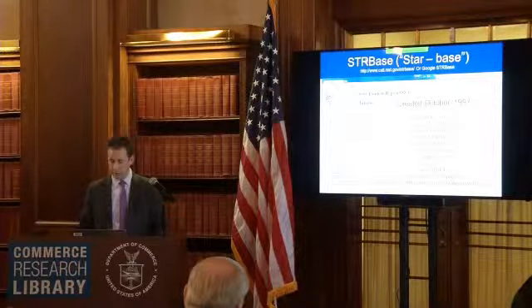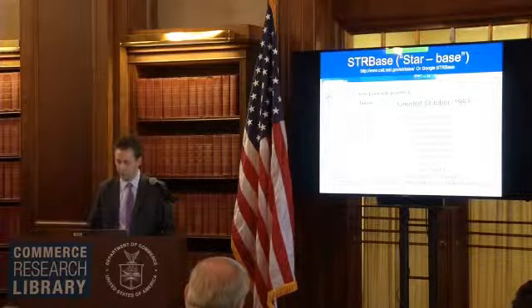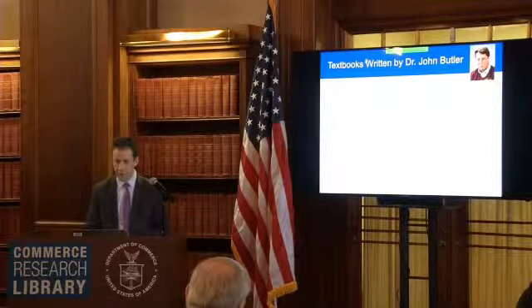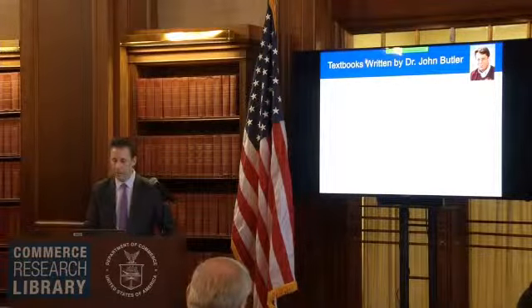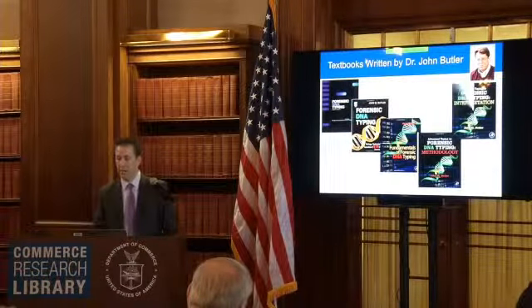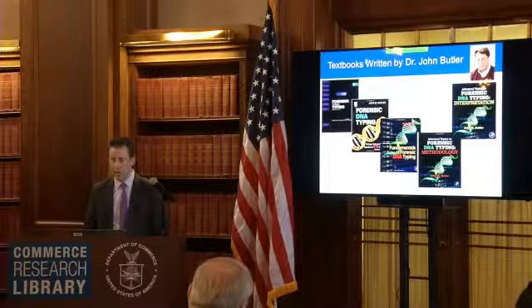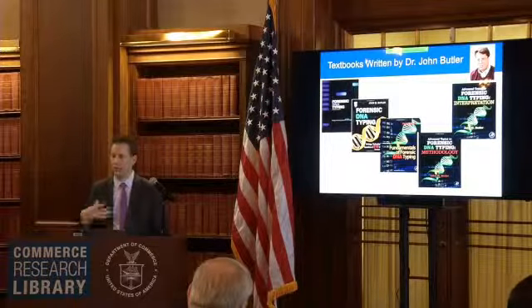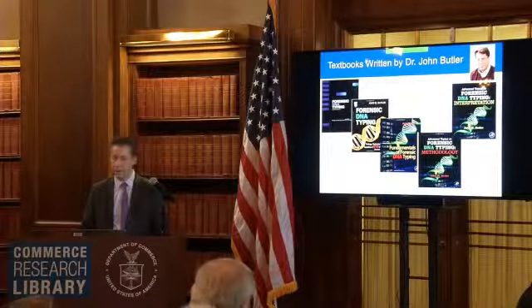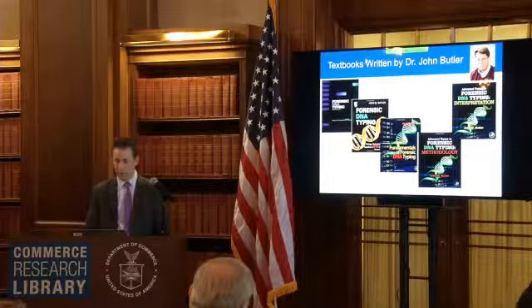We put it up here for free for the forensic DNA typing community. And you can also pull down any papers or workshops or presentations or talks that have been given since about 1998, 2000 or so. And then also I just wanted to show some of the textbooks written by my colleague John Butler at NIST. He was our previous group leader. Over the years, he's written different textbooks on forensic DNA typing, and these are used to teach in undergraduate and graduate courses, but I also find them a pretty good read for the layperson to understand DNA typing. I know judges and lawyers use these as well, because they explain some of the different aspects of DNA typing in easy to digest language.